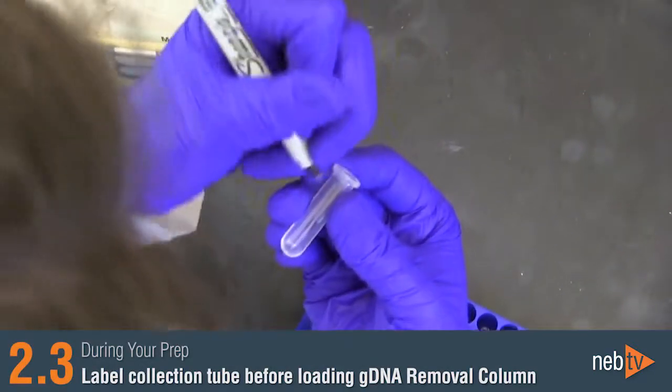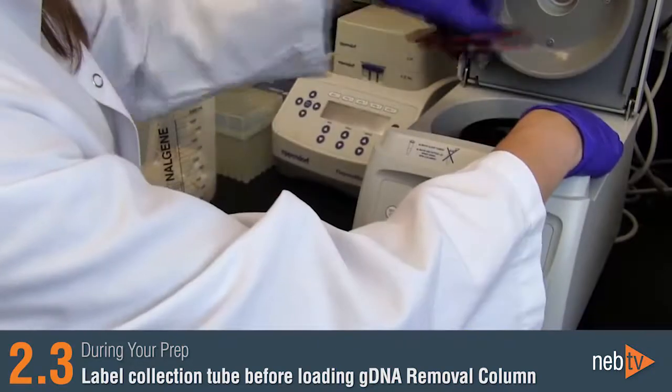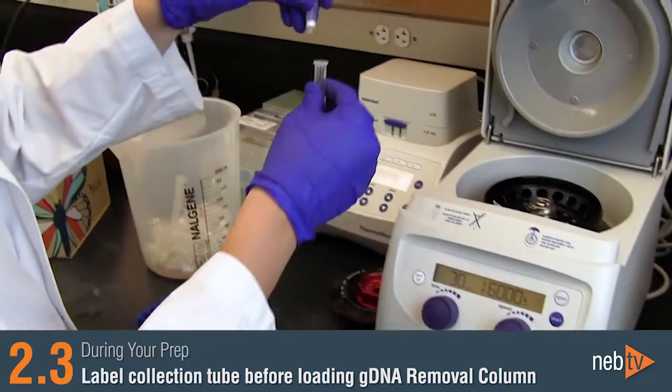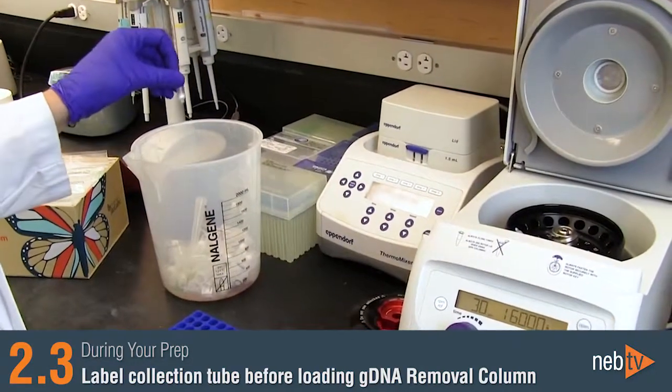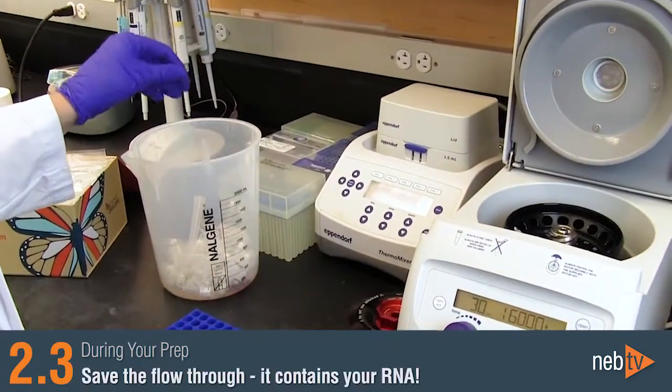Before applying your sample to the genomic DNA removal column, be sure that you label the collection tube, as you'll be discarding the column after you centrifuge. After putting your sample through the genomic DNA removal column, make sure that you save the flow-through. This flow-through contains your RNA.